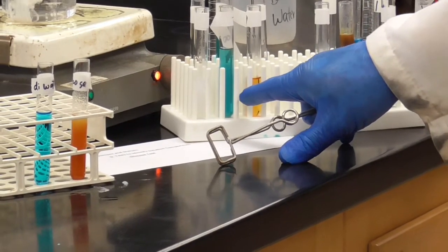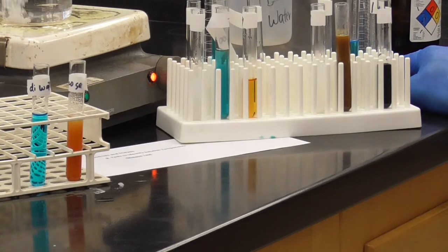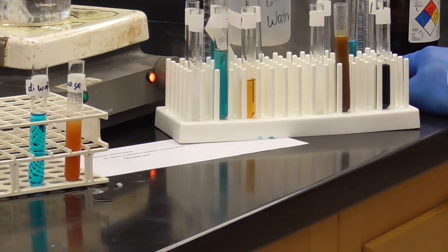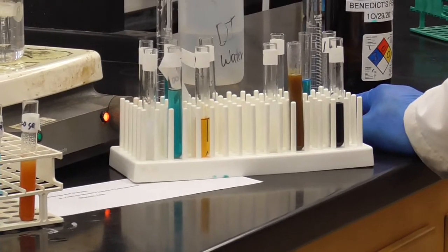Some of it was starting to cross. And I suspect that it was just a slower process, and if we waited for several hours instead of just 30 minutes, and then tested it, I bet you it would be even darker and stronger yet. So it is getting across, it's just a little slower.